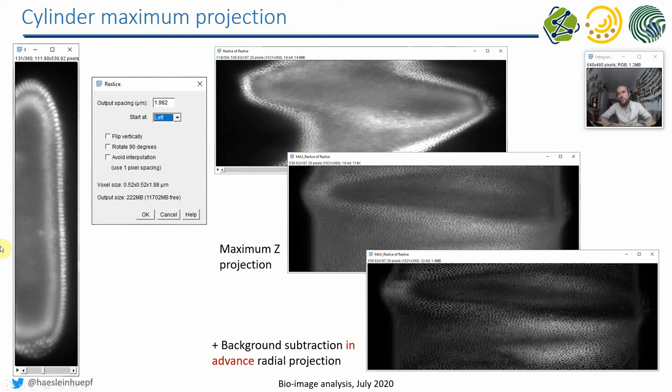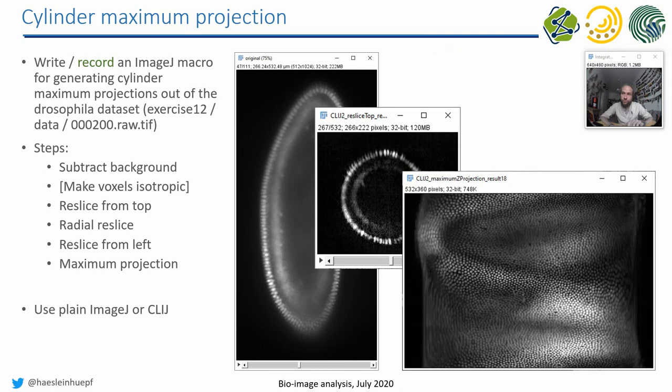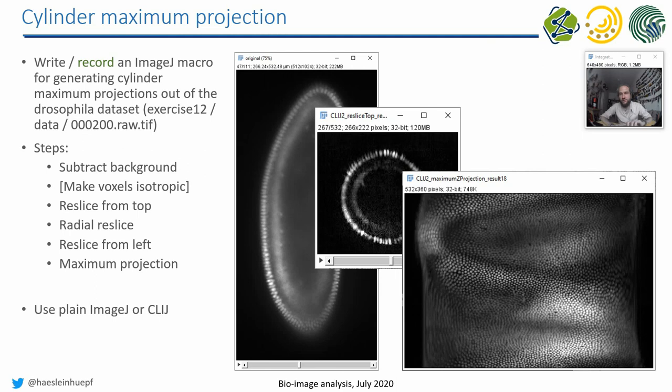That brings us to the exercises. I would like to ask you to do this. Download the Drosophila dataset from last week. It's in the folder of last week. You do these reslicings in the steps I just showed. You also find them here on the left: reslicing from the top, radial reslice, and reslicing from the left. Then you do a maximum projection. You can do this in ImageJ macro, and you can do this in CLIJ. I would assume that on a graphics card it's faster. Furthermore, try with and without background subtraction to get a bit of feeling of why we are doing this.